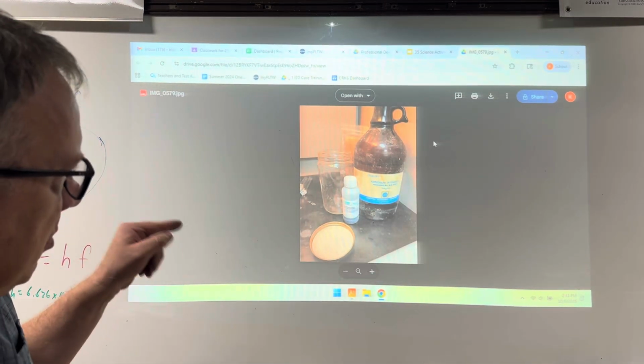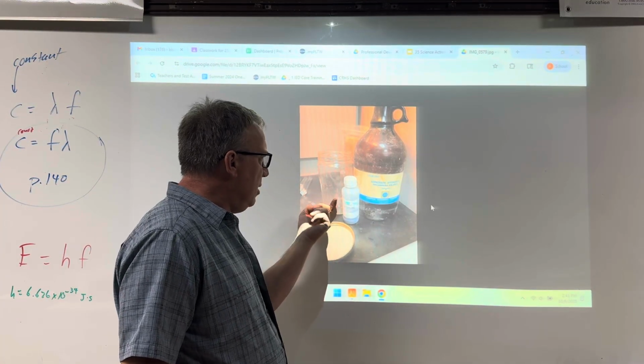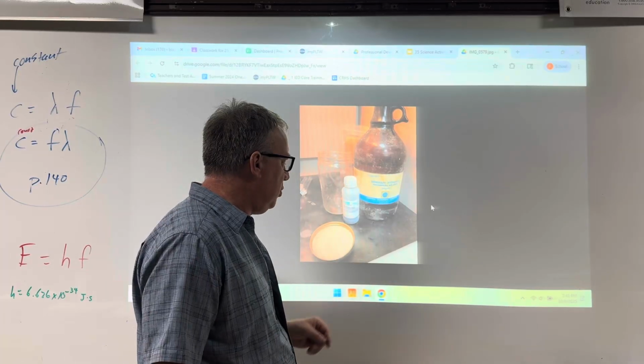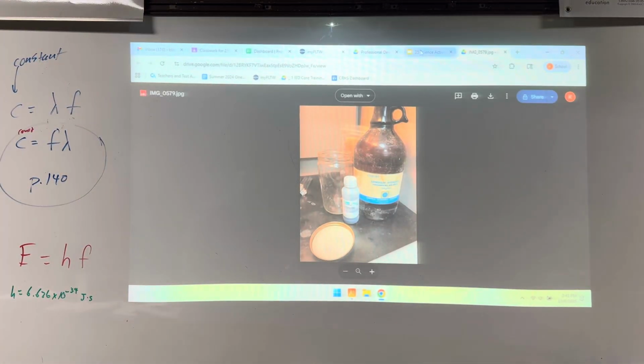Anyway, so I put a little ammonia atmosphere in there, and this probably takes a couple of minutes. I left it in there for 20, 30 minutes, pulled it out, and it still smells like ammonia. Okay, so let's go back to this.